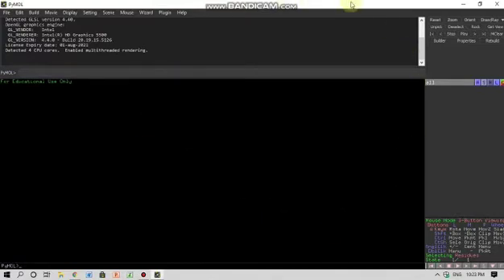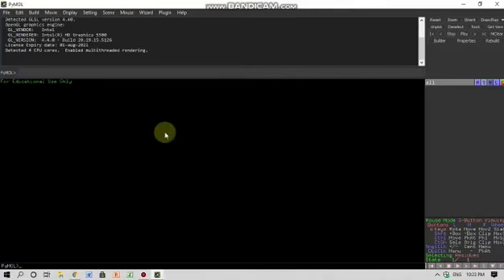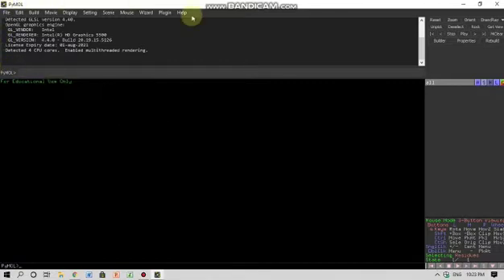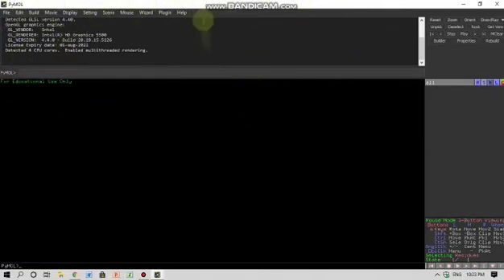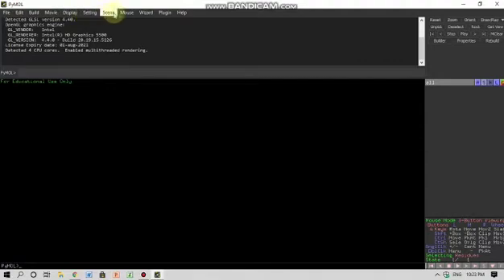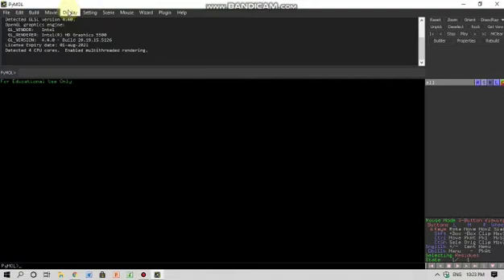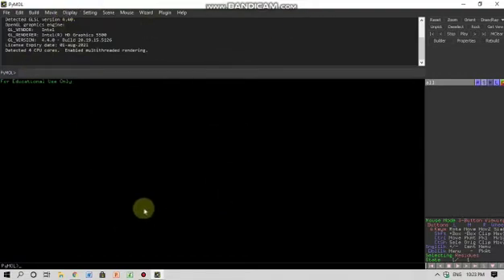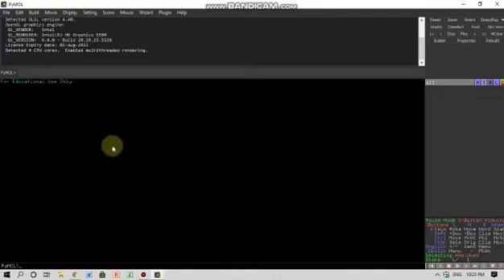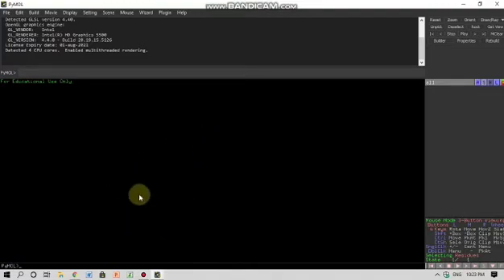Now I'm going to describe the different parts of this software. This uppermost is the upper control panel where my cursor is moving. These are the different functions or buttons on which you can click and customize the things that you want. This huge black area is the display area where your protein will appear and you can actually visualize it.